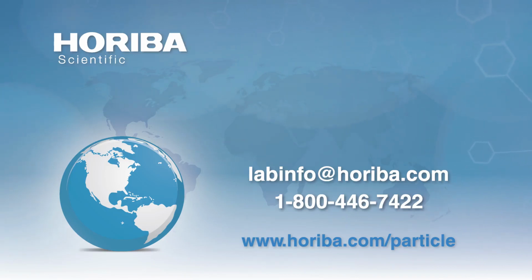The next question is, is it possible to measure particle autofluorescence and distinguish what subpopulations of particles have that property? Okay, so I assume by autofluorescent you mean that the particle incorporates fluorophores, and so you can distinguish particles with fluorophores from particles without fluorophores. I don't know if that answers the question exactly, but that's probably the best I can say right now. Thank you. Are there any solution conditions that are incompatible?